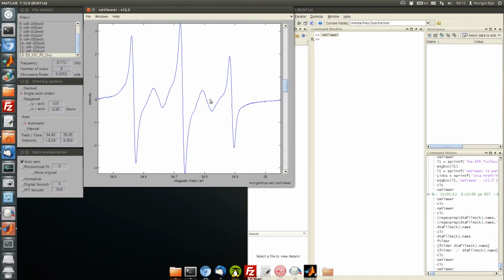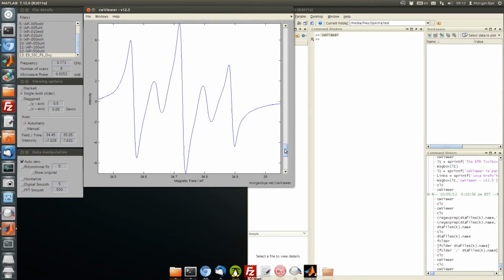unfortunately at the moment every time you click through on one of these the microwave power should change, and it's not, so I will change that once this video is concluded.